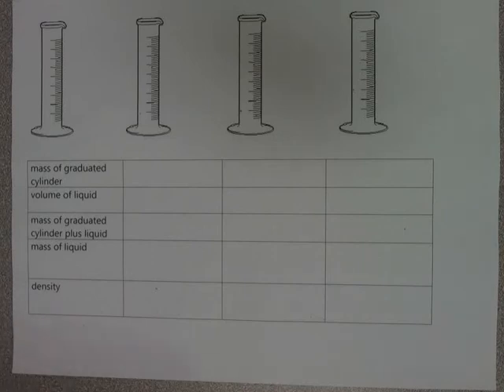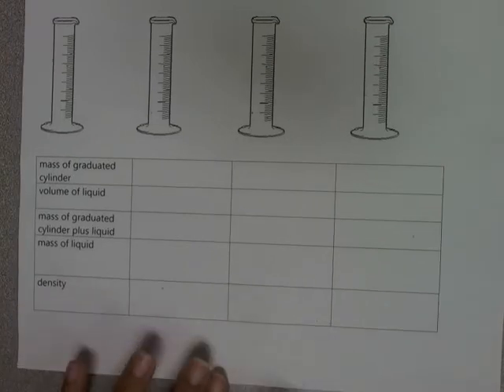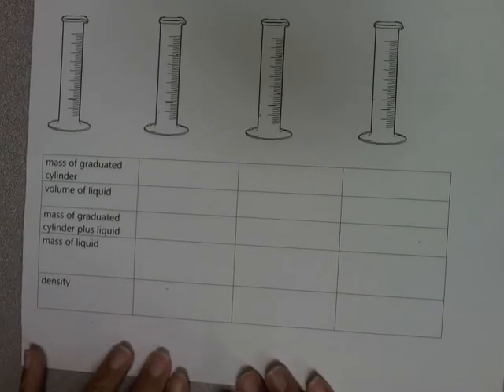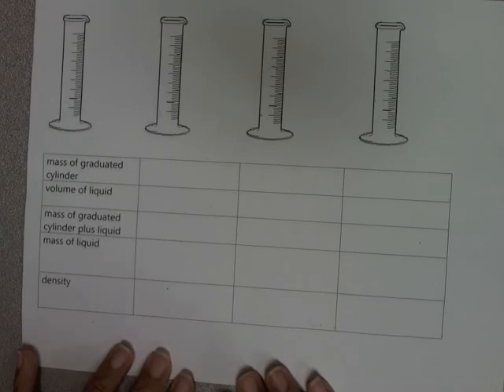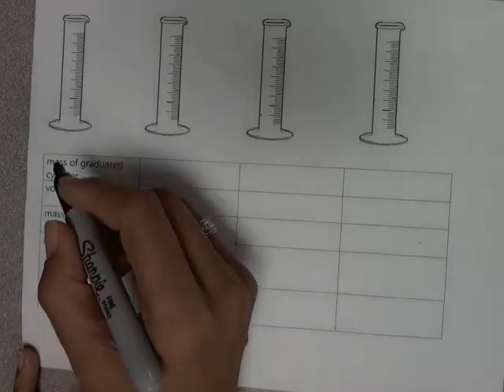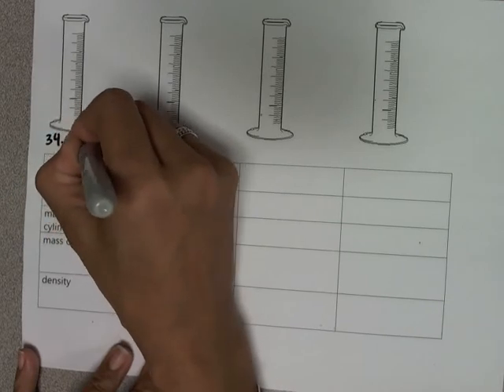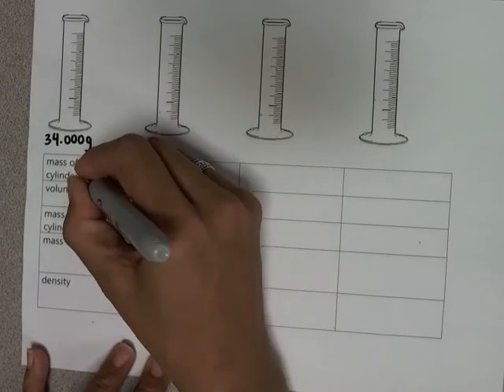In Lab 2, we are asked to find the density of a liquid. We start with an empty graduated cylinder, and we find the mass of that empty graduated cylinder. So let's say that the mass of the empty graduated cylinder is 34 grams.